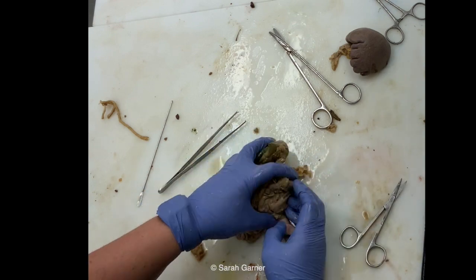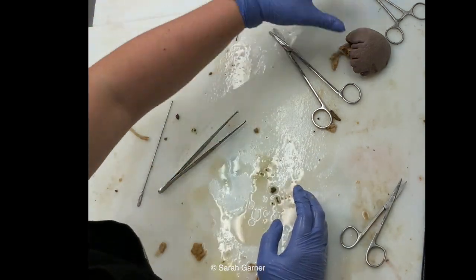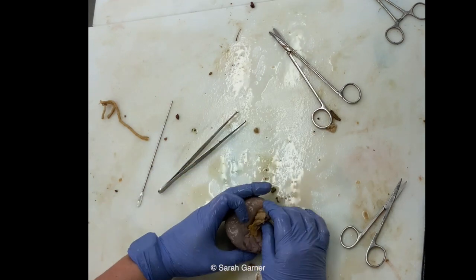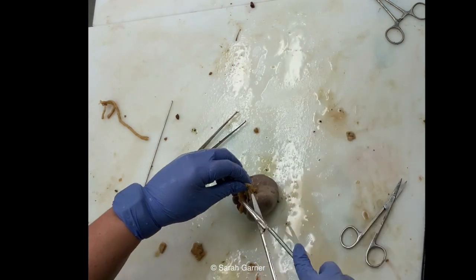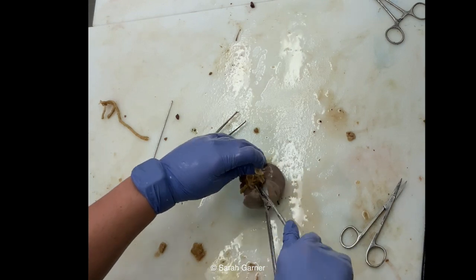Okay, that's that part. Then lastly, for our abdominal block, we took off that spleen and we already weighed it, right? So really all that's left to do is just serially section this.